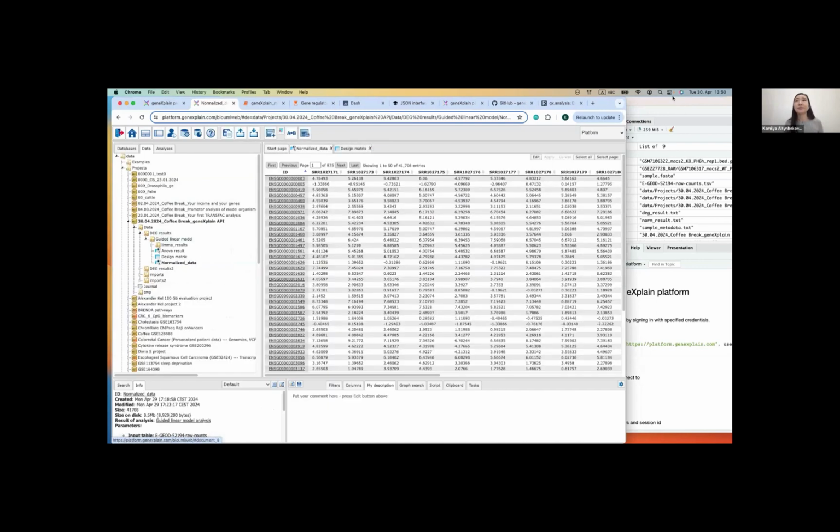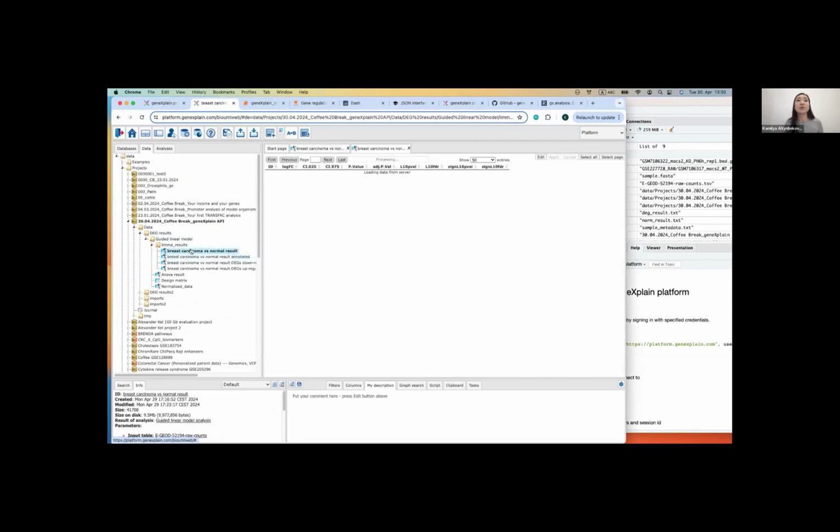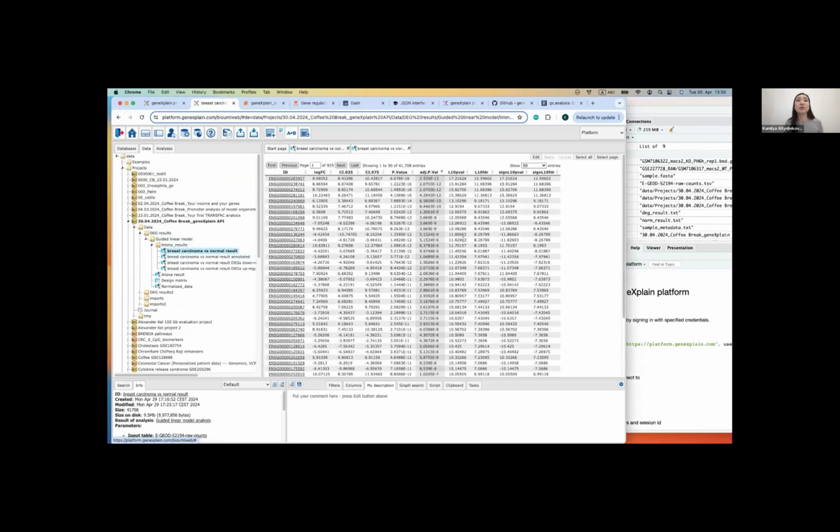What I primarily was working with: maybe you are not very satisfied with the parameters that are hard-coded into our workflow to select up and down regulated genes. So you want to work with this whole table here.